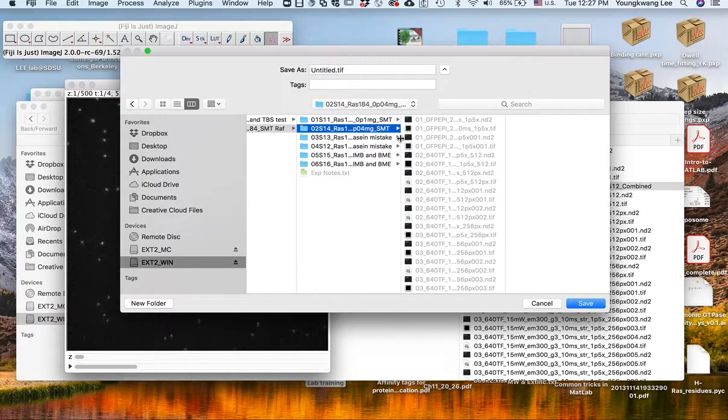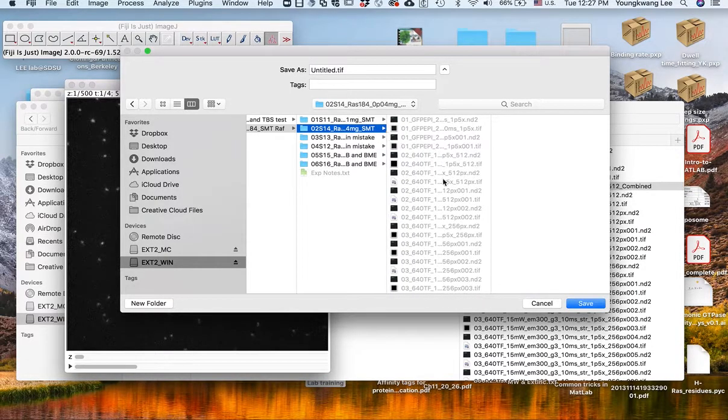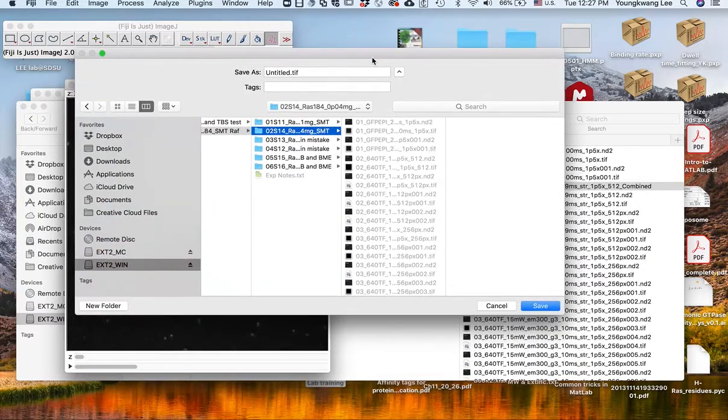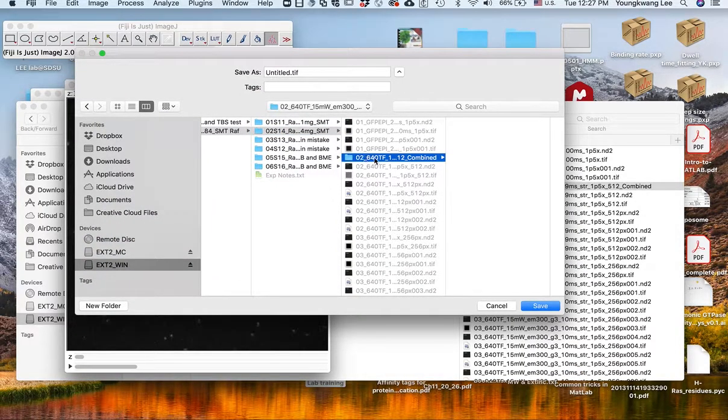It's RAS 184. Let me see. I don't see the folder though. Okay, here we go.